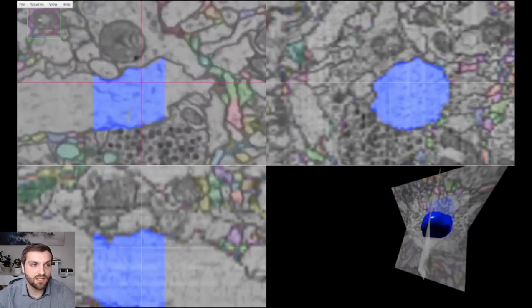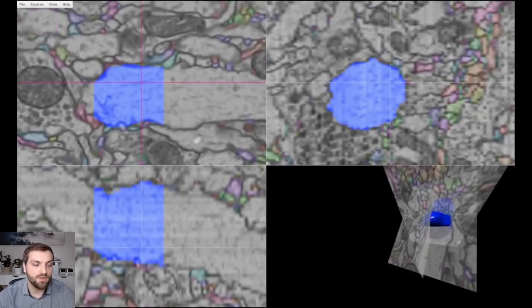And then ultimately, when you're happy with it, you can submit that and you generate a mesh, of course, and you can view the result of the interpolation in 3D. And it's a really nice starting point to be able to refine from to get a large volume, especially for structures that are shaped like this.